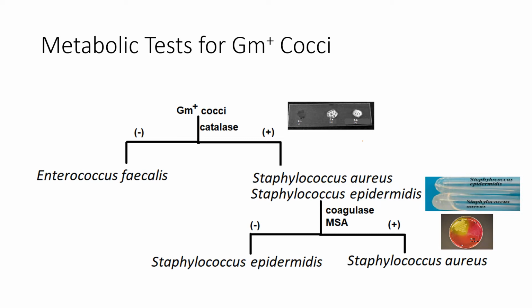The answer may well be it can't ferment anything, but I can't determine that from mannitol salt agar. This is the really unfortunate thing about us not being able to meet and see each other, because this is the kind of thing I hammer home in these tests. Every test will let you make one, maybe two conclusions. You can't leap to all kinds of other thoughts.